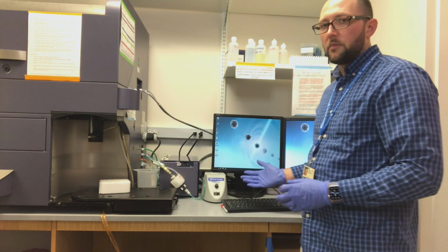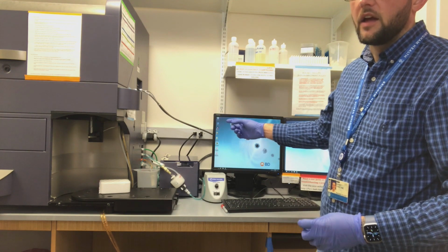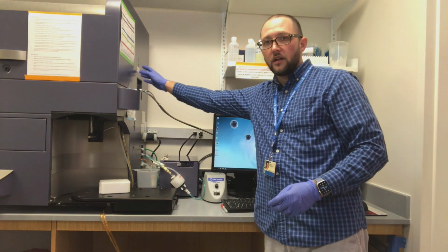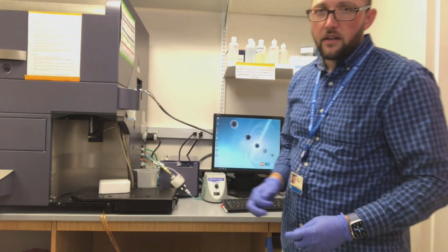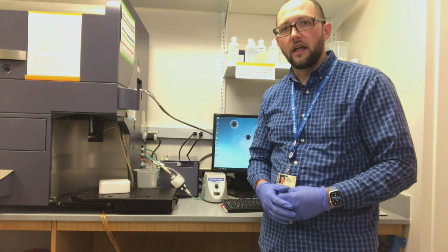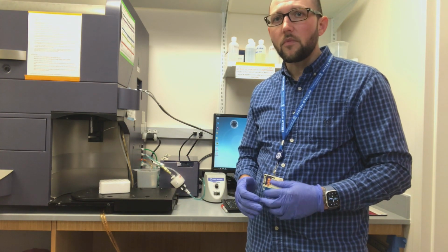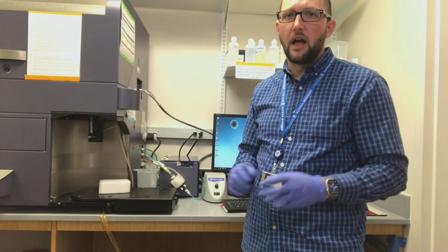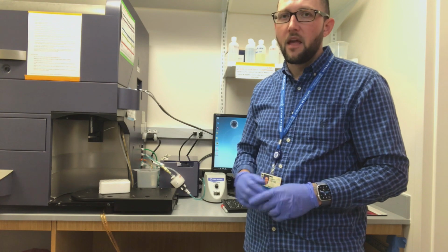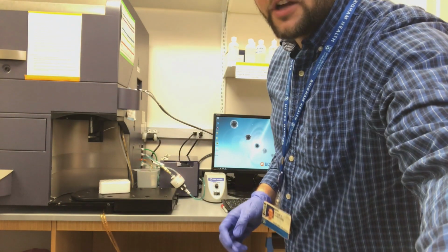So after we have our computer booted up and TerraTerm open, we'll want to turn on the power to the actual cytometer. It's a green button right here on the side. The Fortessa requires at least 20 minutes, up to 30 minutes, to fully power on and allow the lasers to come up to power so that they're stable and ready to operate. While we're letting the machine power up, we can check our tanks.